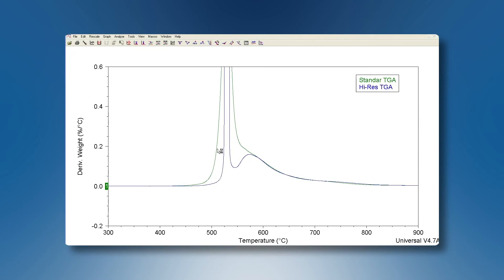I would like to show you an overlay of these two experiments. The green curve is the standard TGA and the blue one is the high-resolution TGA. As you can see, in the standard TGA we cannot differentiate between the two degradation processes that are present in the sample. But with the high-resolution TGA it is easy to see that we have two degradation processes and it is also possible to quantify them.